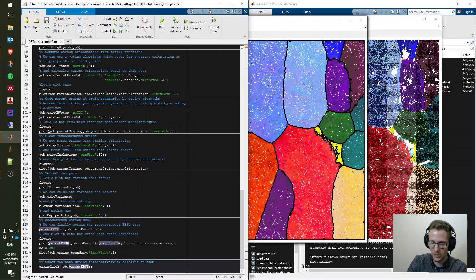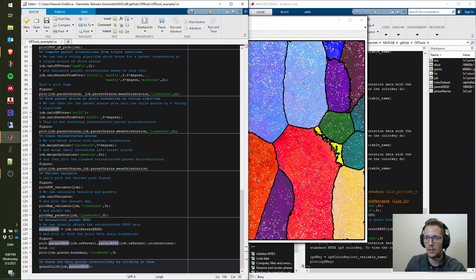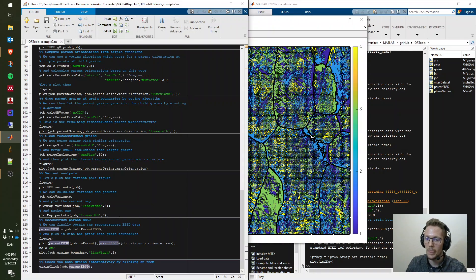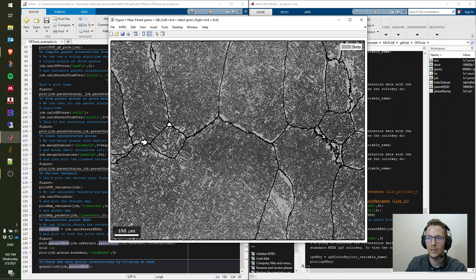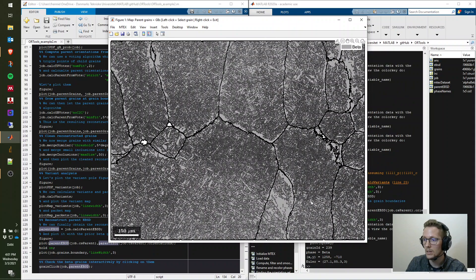As a final part, I demonstrate the grain click feature introduced in example one. Note that all figures will close when you run this section to avoid running out of figure space. You can click on any prior beta grain to get detailed information about that particular grain, which is identified in the command window while plots are being generated.